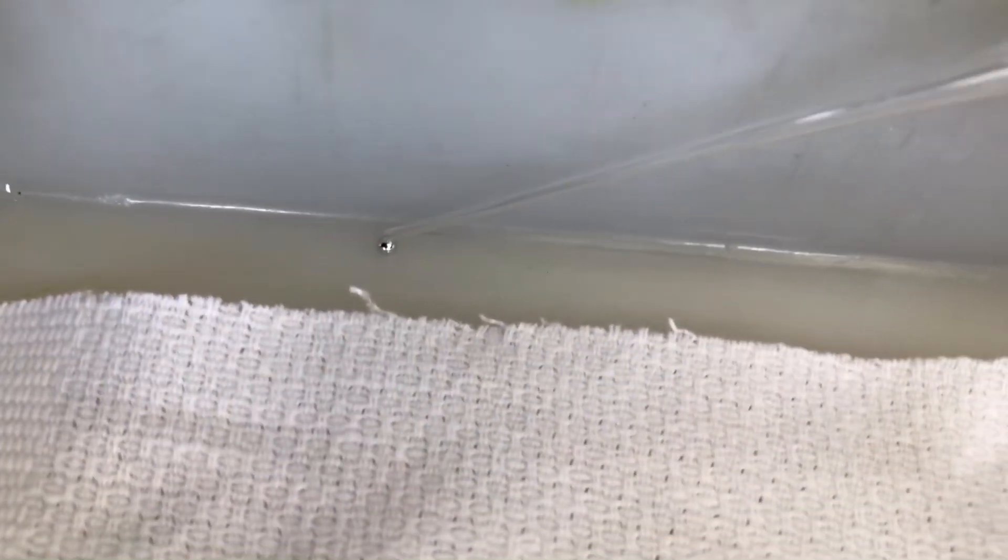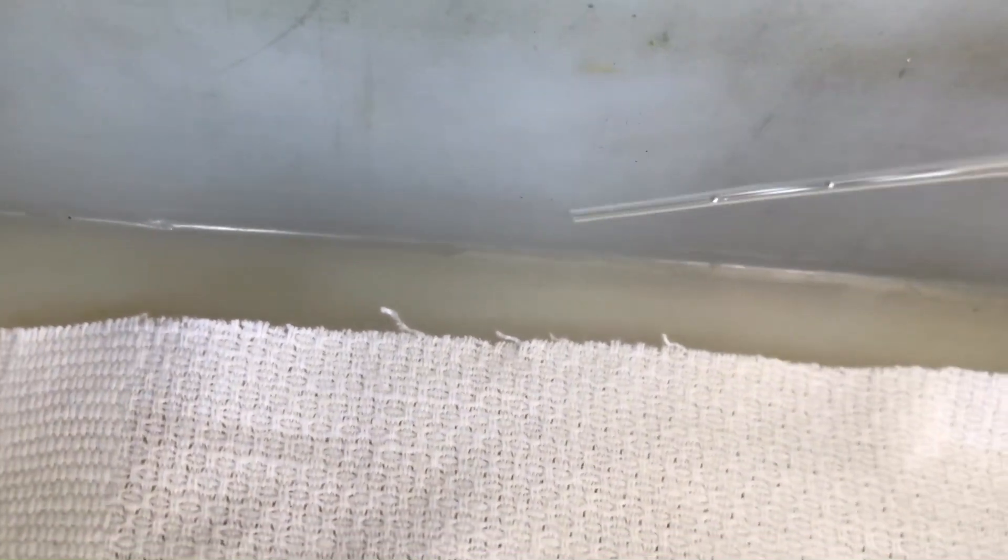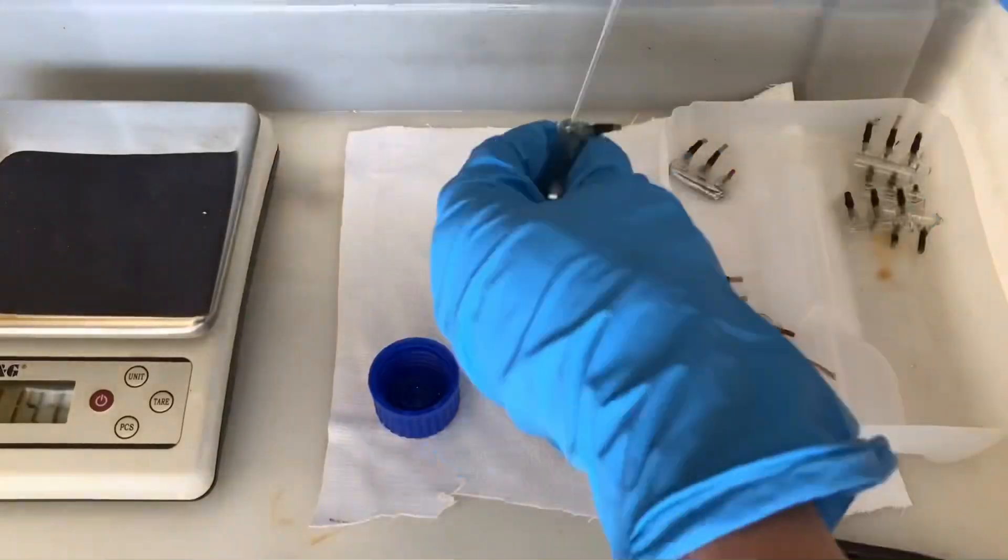It really likes to spill everywhere while transferring it from one container to another, because it's really heavy and it likes to spill. One by one the switches were opened and emptied.